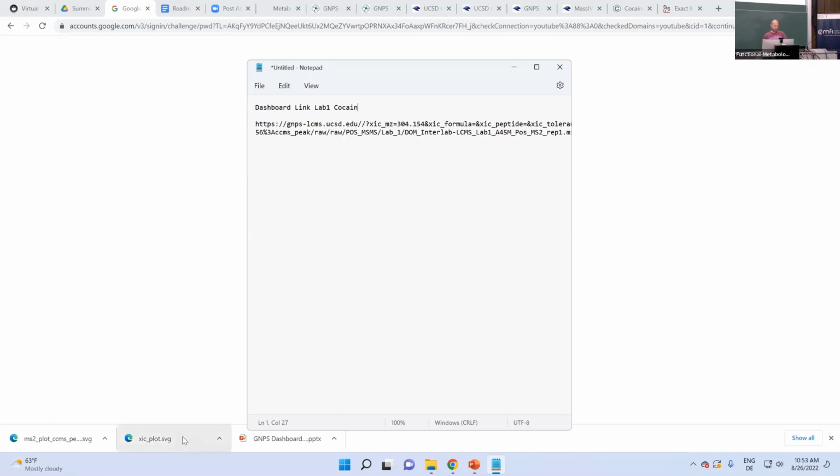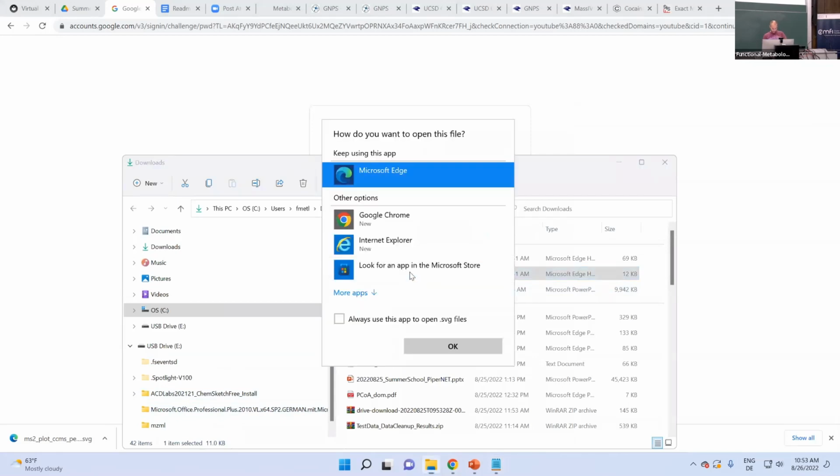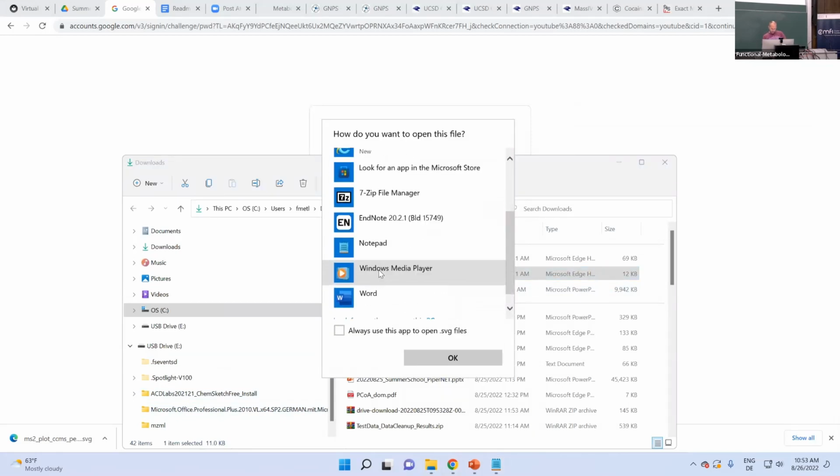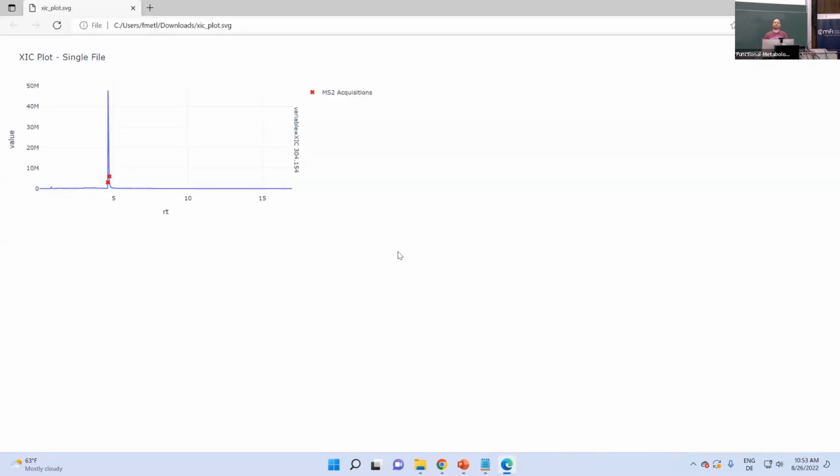Then now the SVG here, I don't know, is there Inkscape already installed? If I had Inkscape installed, I can directly open it and then combine it with whatever other elements into a figure.